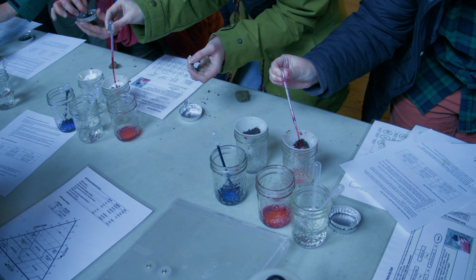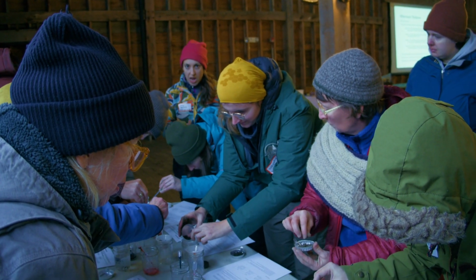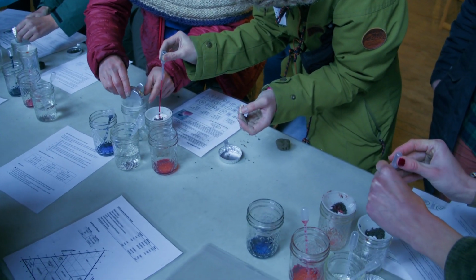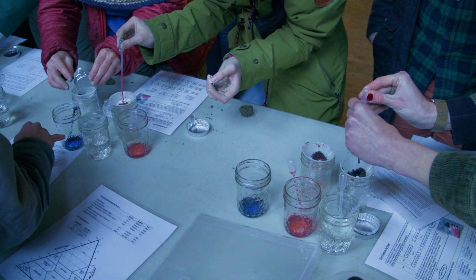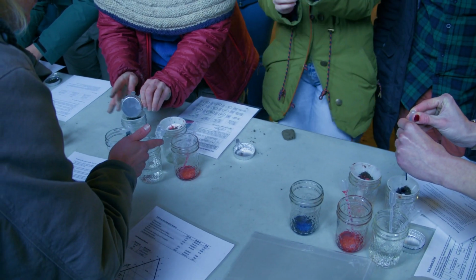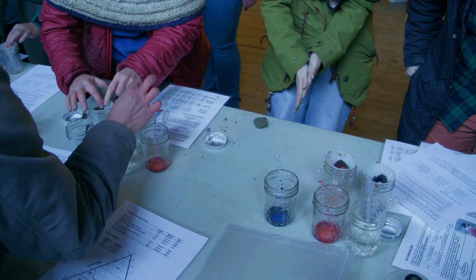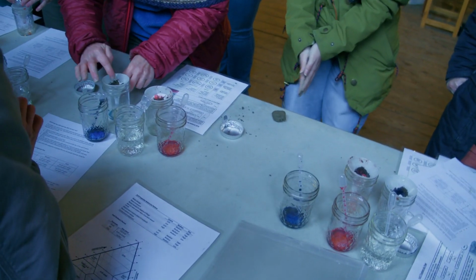So what we're looking for is for the water to come out the bottom and to see if there is dye in that water. Oh yeah, there's dye in that blue. Awesome. Yeah, just gently. And what is the dye? So this one is positively charged, and this one is negatively charged. It's to see if your soil can hold on to positively charged ions and negatively charged ions or not.